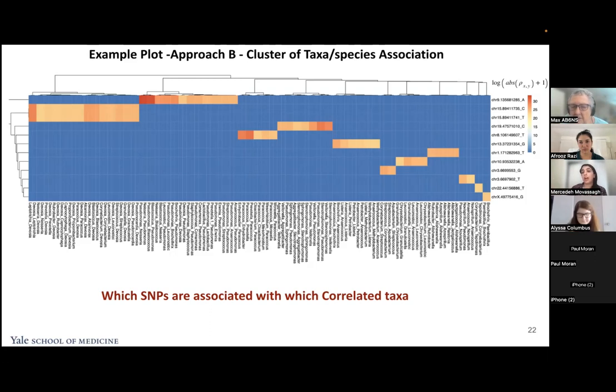That's a very good question. I have not tested that, but what I would assume based on the logic, for example, if you have vaginal sequencing data, there are clear communities that you see using Euclidean distance. What I assume is that you'll see a similar relationship if there was a variant associated with those communities as well. So you would see this variant is present, and all or most of the bacteria within that community show a similar response, because that's the initial way of characterizing communities in 16S, with Euclidean distance or topic models. So you should be able to see that. Thank you. Sure.